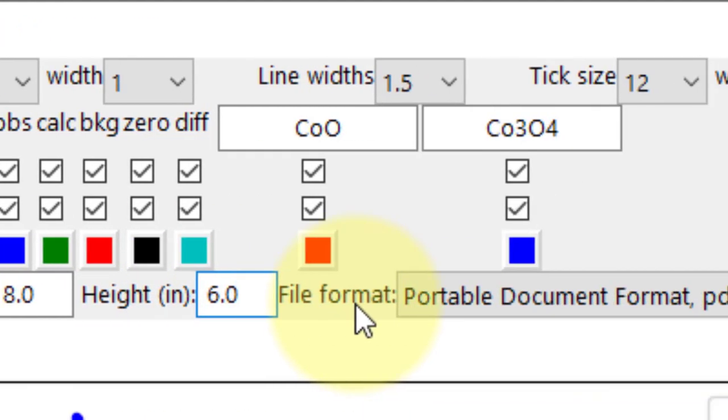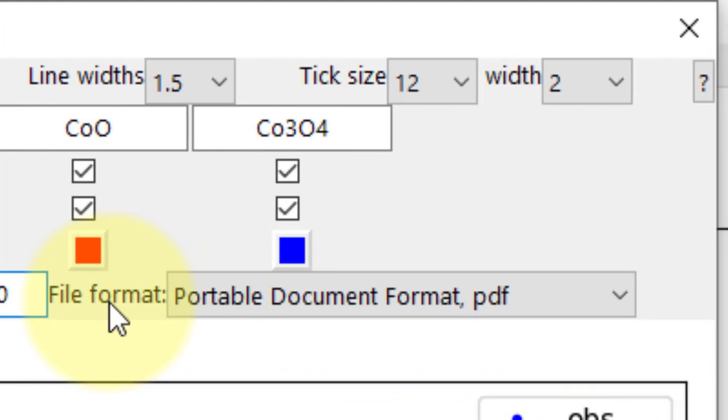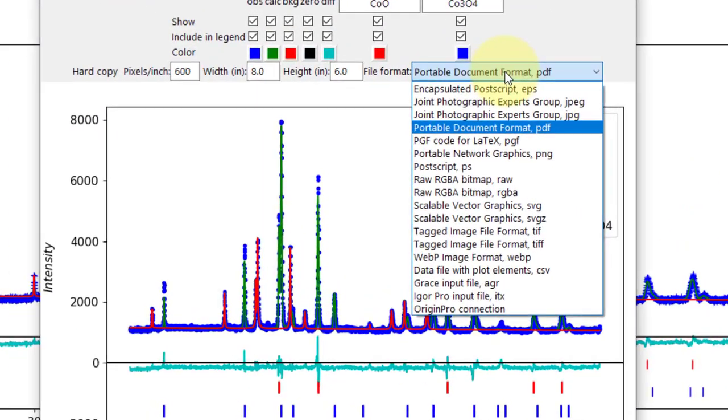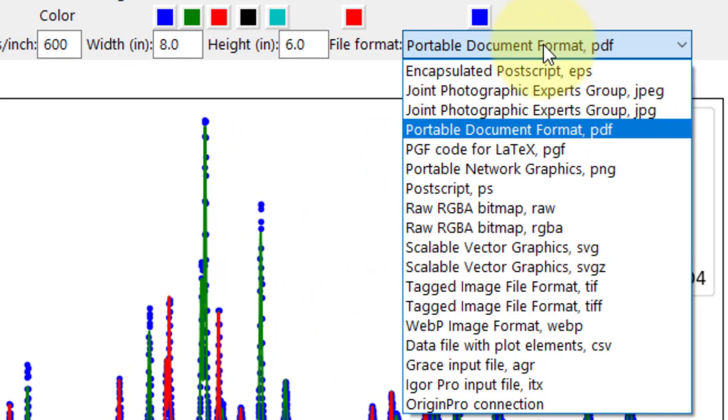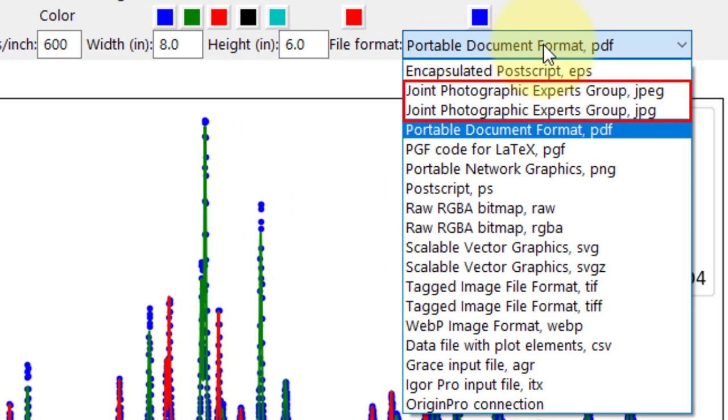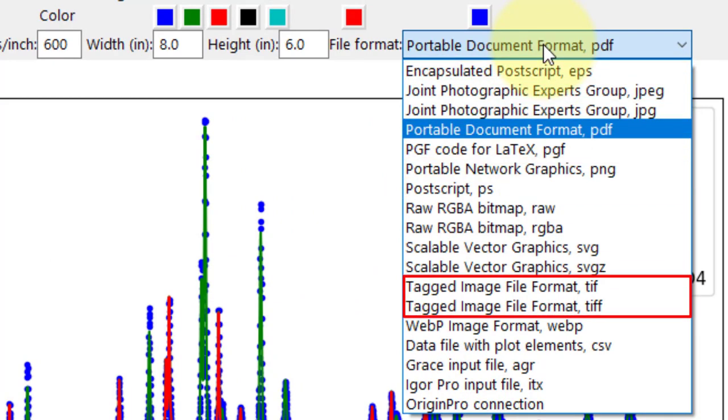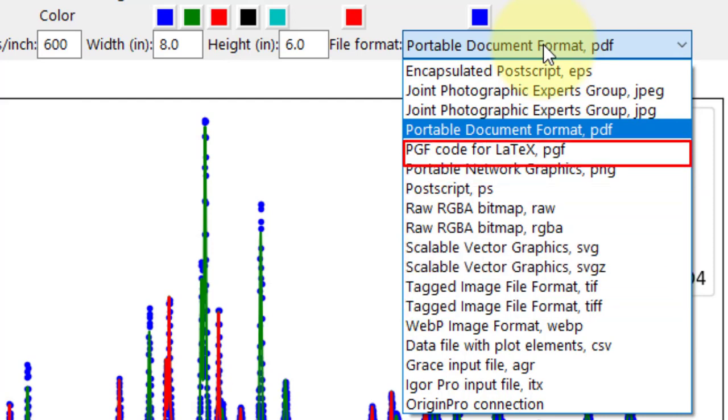The file format is PDF by default, but there are many options like EPS, JPG, PNG, TIFF and more. For instance, PDF is suitable for LaTeX.